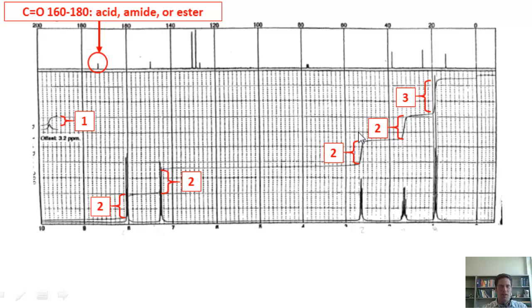Now that I've measured my integrals, I figure out what those individual pieces are based on where they appear in the NMR. This signal over here is offset by 3.2 ppm, which means that it's actually appearing to the left about 3.2 ppm, so it's somewhere around 13. What kind of hydrogen appears at 13? Carboxylic acid hydrogen. What about these two signals? I've got signals that are 2 to 2 in 6 to 8 region. This is aromatic land. Now granted, this is slightly outside of 8. Don't worry about it. Aromatic land.